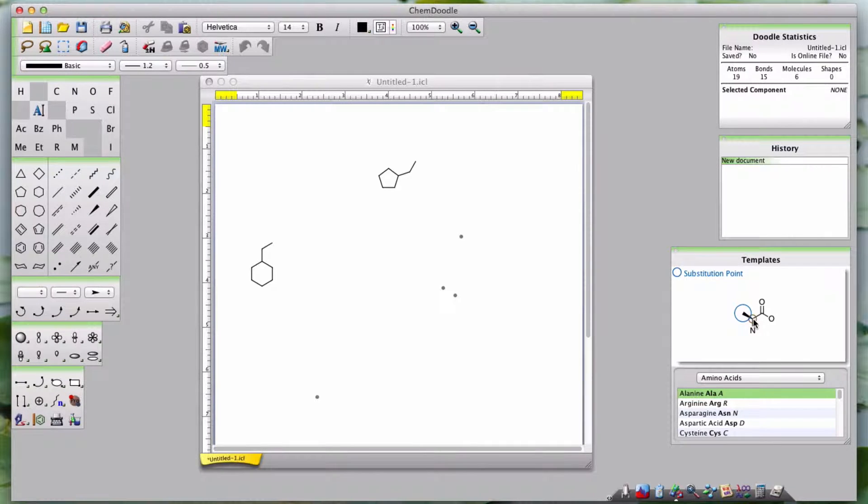The Substitution Point indicates the atom that will be overlapped with the atom the template is connected to. This means that you must click on the Substitution Point you desire and then click on the atom within the doodle area that you want it to overlap with.